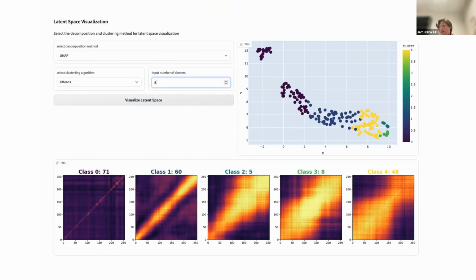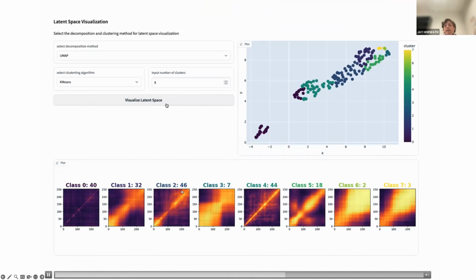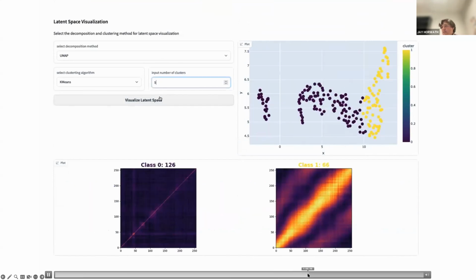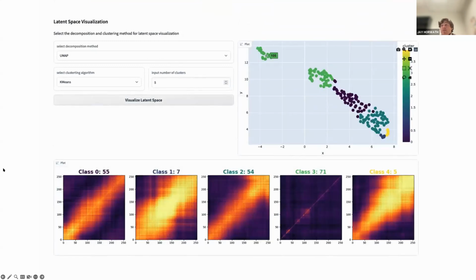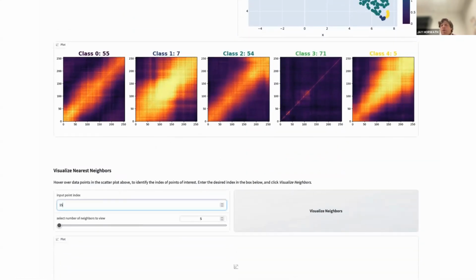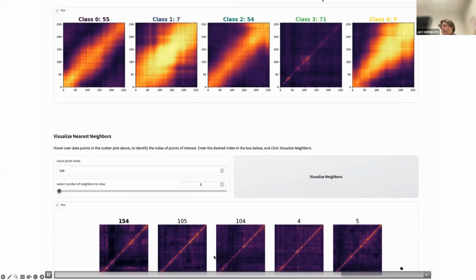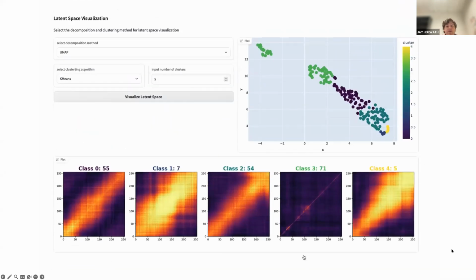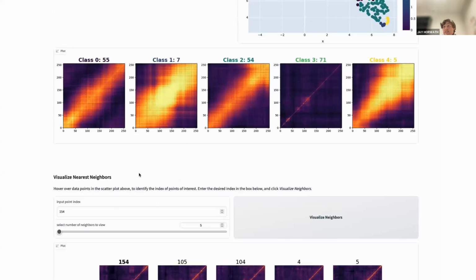We have clustering, we can sample the different clusters, you can change the number of clusters on the fly. And so I'm just going to try to skip ahead here a little bit. And then what you can also do is sort of recognize, what did the different neighborhoods show? Here we're highlighting one sample that sort of looks like an outlier. And we see it's actually really fast dynamics where we don't actually see much evolution, which is distinctly different from the rest of the data set where we can actually track the dynamics.